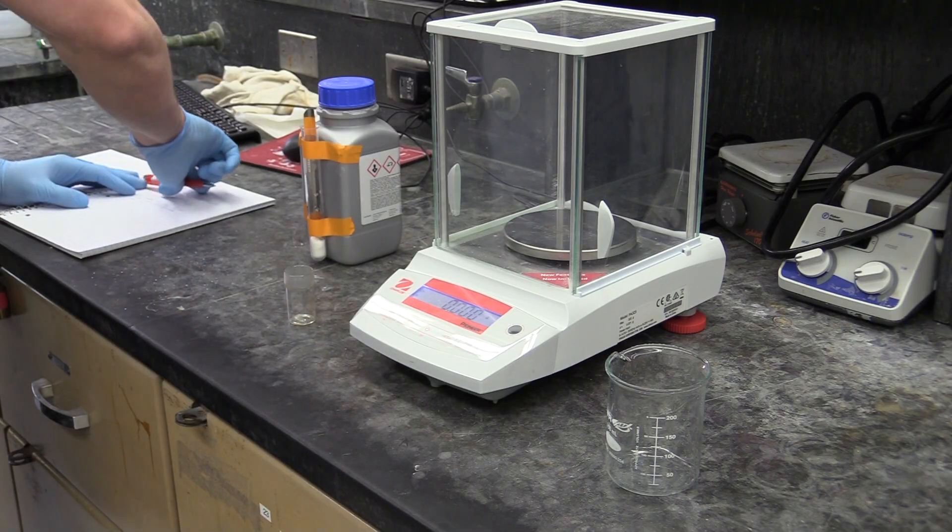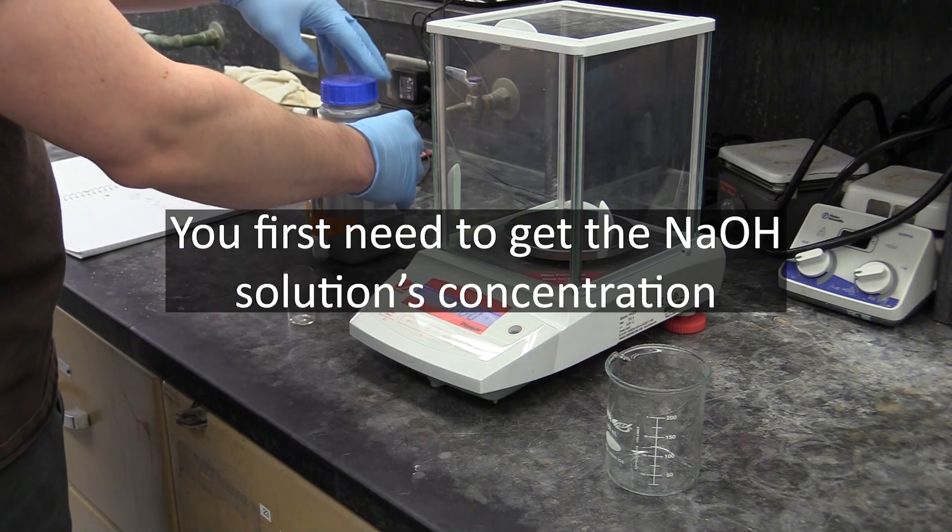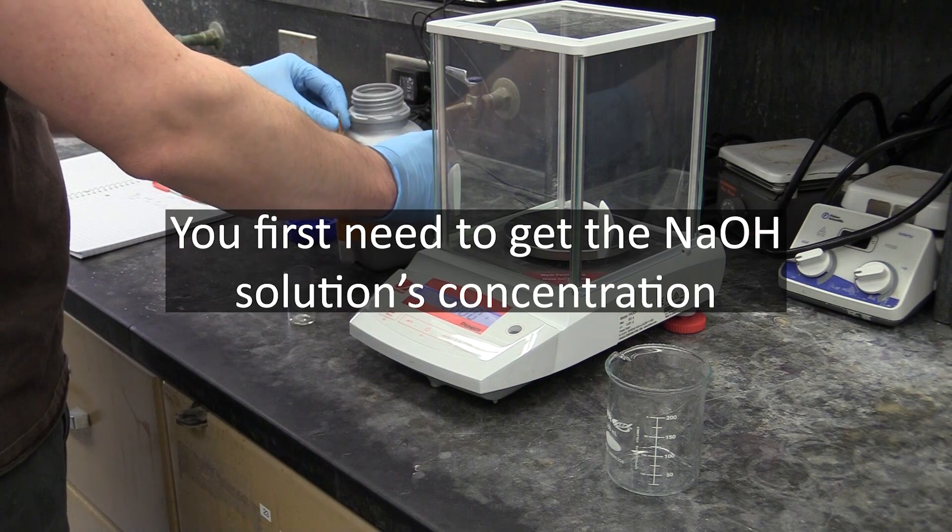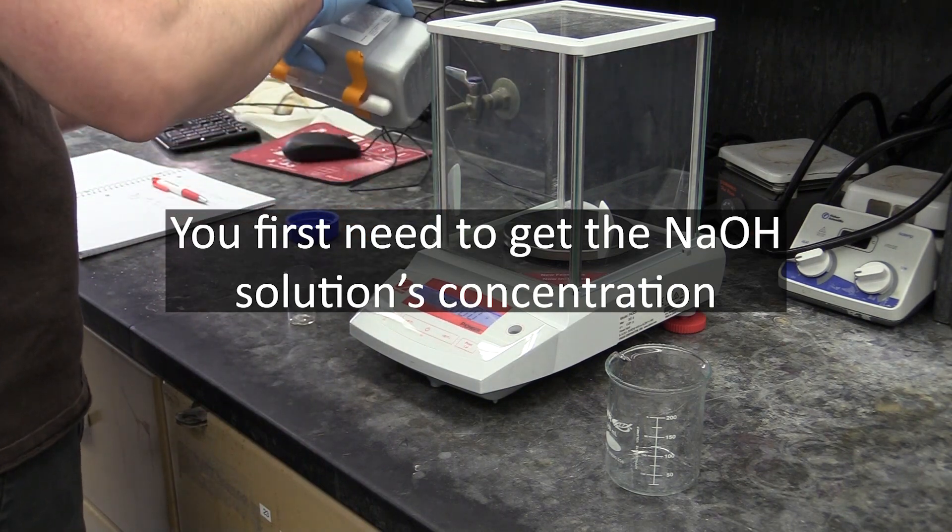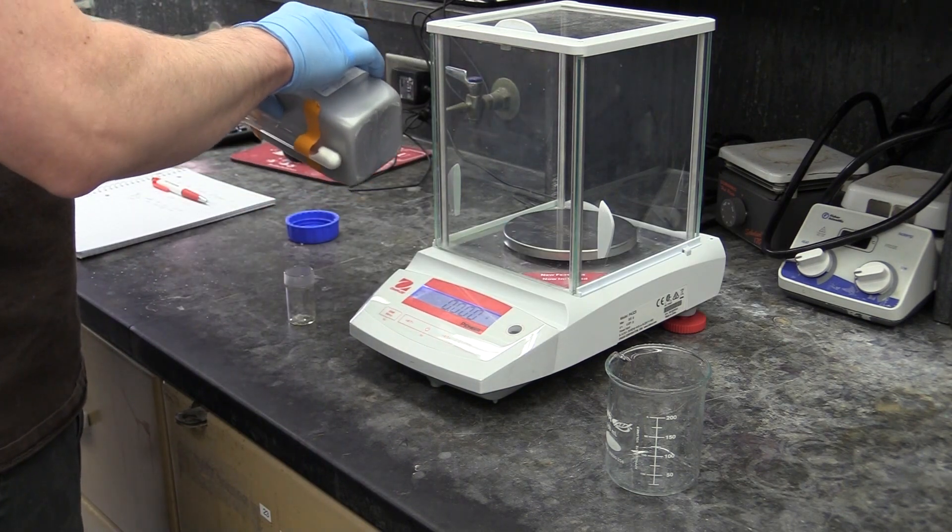Before you can use your sodium hydroxide to analyze an acid, you have to determine its concentration. From a procedure standpoint, the way you'll do this is nearly identical to how you'll analyze your unknown acid.